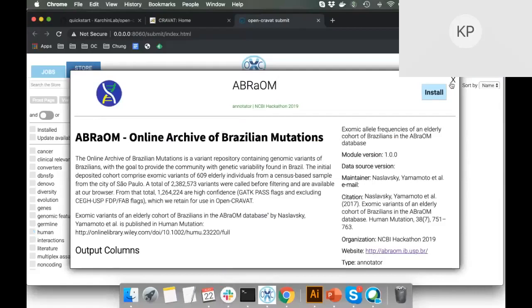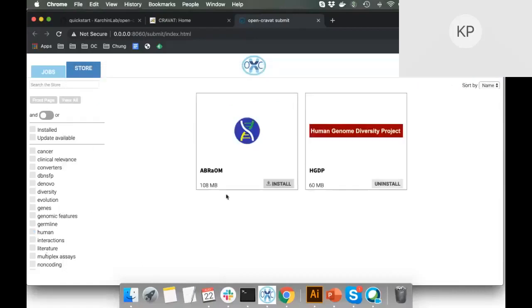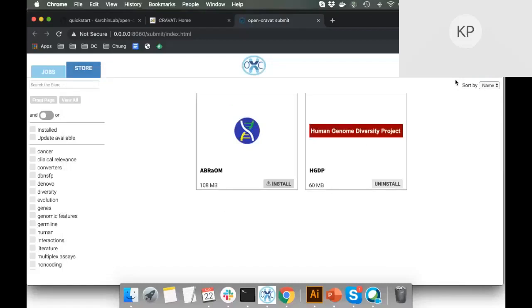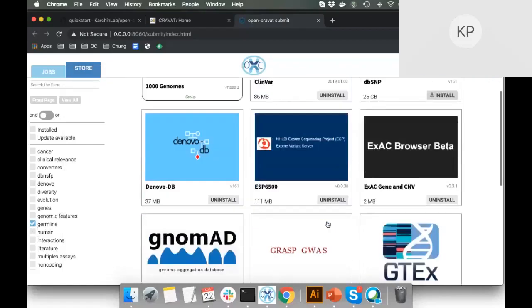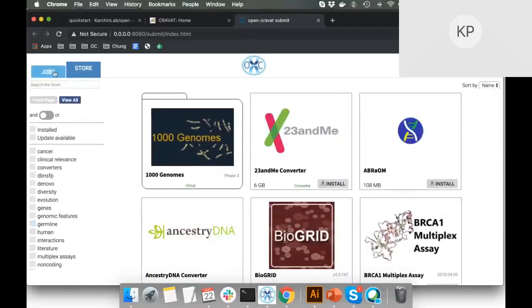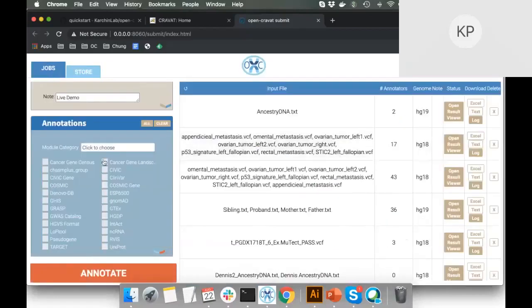So if you've got a particular database that you're interested in, but don't necessarily have the time to add it to the store yourself, we will get around to it in due time, depending upon how complicated the source is. This one took a couple months for us to get around to it because we were very otherwise detained doing hackathons and whatnot. Okay, that module is installed.